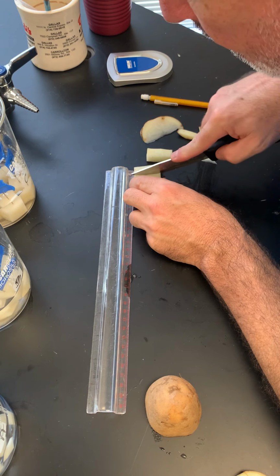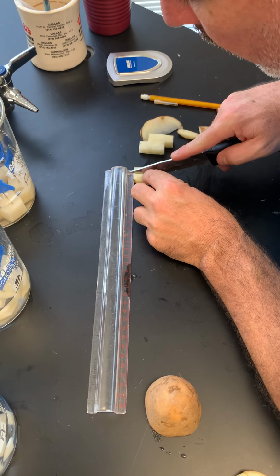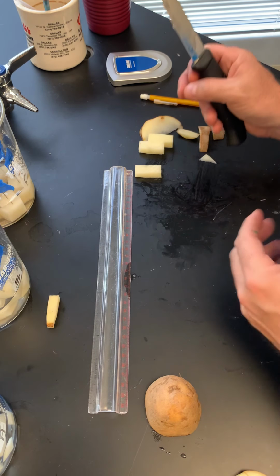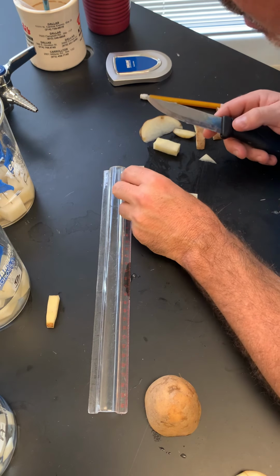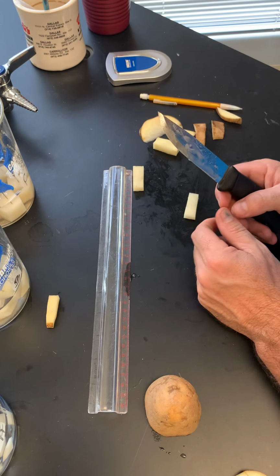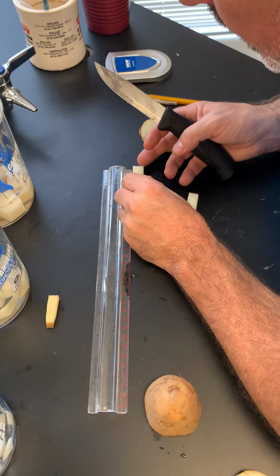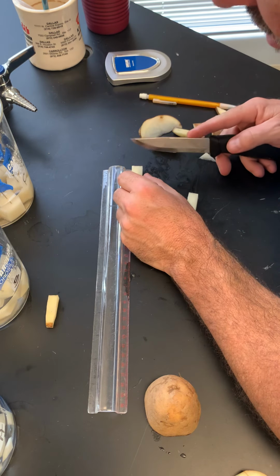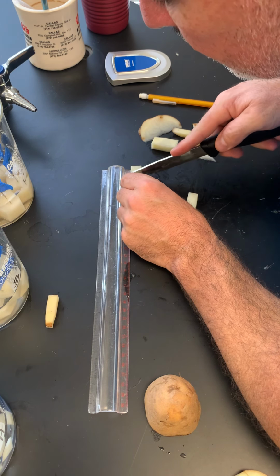Another centimeter here. And I know that you're going to be measuring really small changes, but you want to try to get as close to 1 centimeter as you can, because the difference when it gets larger, especially if you use one that's small like this, maybe small is actually going to be the best because it's going to expand more quickly. It may go from 1 centimeter to 1.2 centimeters, and so the difference is only going to be 0.2 centimeters, which is 2 millimeters. So let me get that cut there.